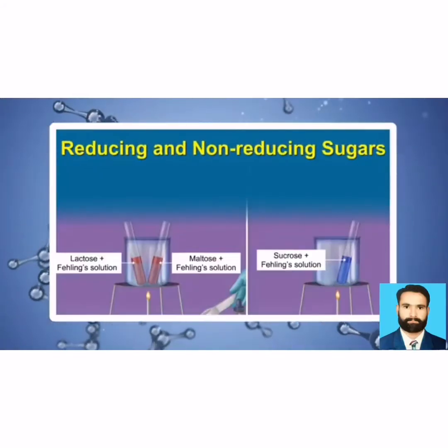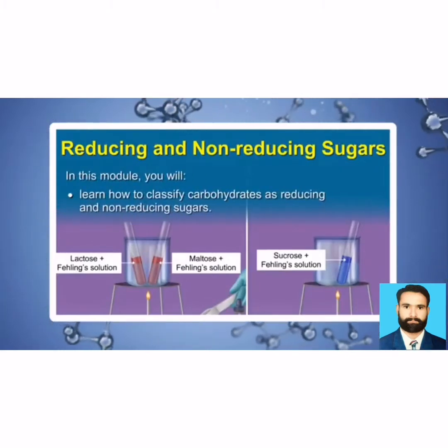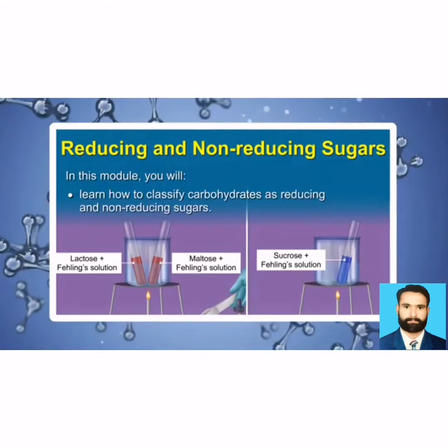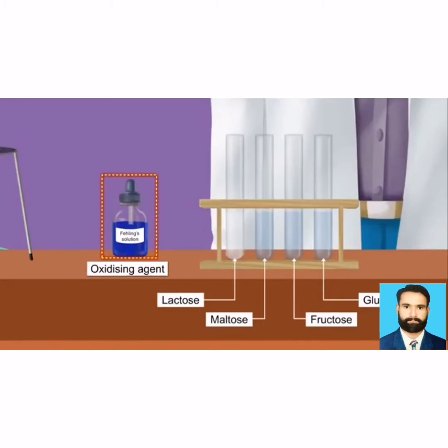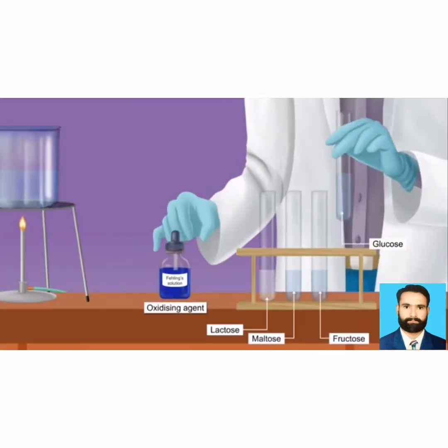Reducing and non-reducing sugars. In this module, you will learn how to classify carbohydrates as reducing and non-reducing sugars. Let us begin our study by considering the reaction of common carbohydrates with an oxidizing agent like the Fehling solution, which is a blue liquid. Let us first consider glucose.